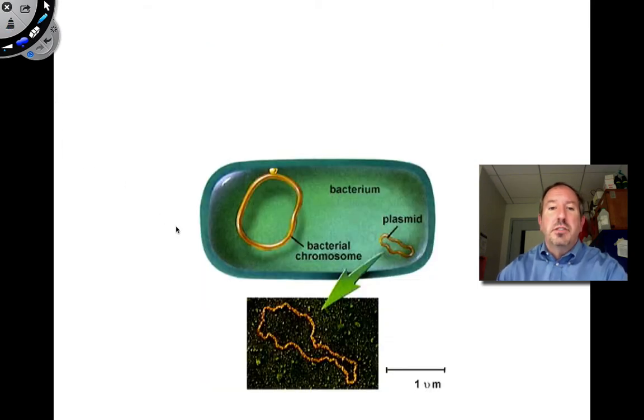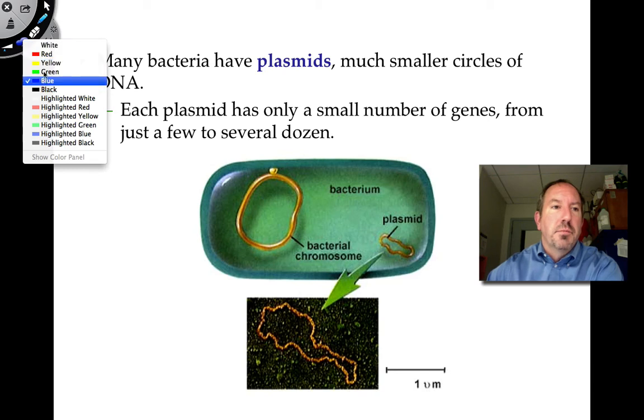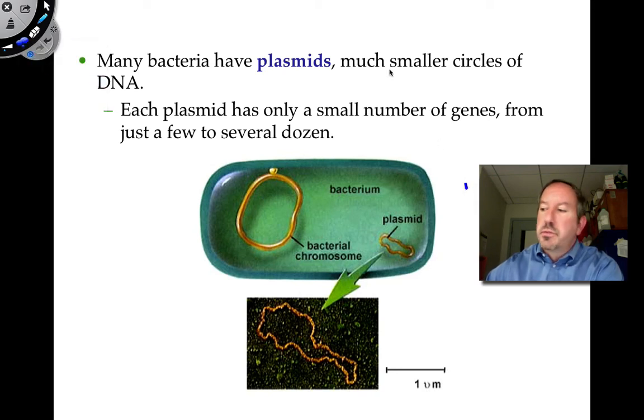So how is it that we're going to do that? Well, let's mention one thing about a bacteria. Bacteria has just one chromosome, and then they have these small little sort of rubber band pieces of DNA called plasmids, and they actually have many of them. Only one is shown. It's a cartoon drawing of that. It's in a circle. Actually, this is a real transmission electron micrograph of a plasmid. What we're going to do in class is take the redwood DNA. Let's go over here and do redwood DNA. Let's make a little piece of it like this, and we're going to put it into the plasmid.